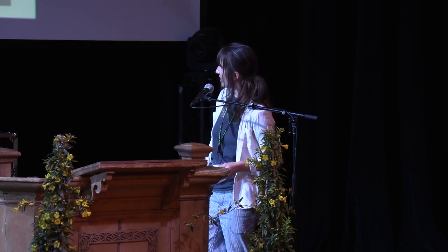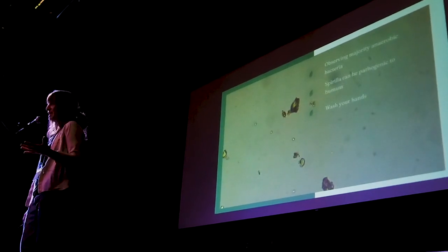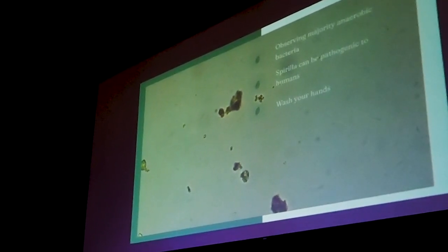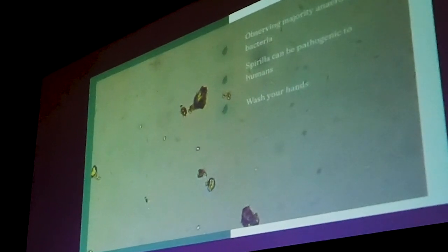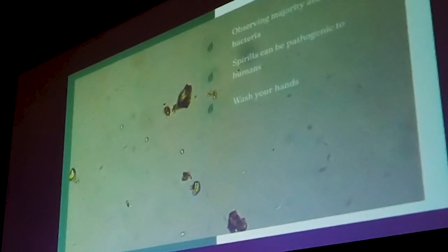It's kind of hard to see on the big screen, but these are the one organism that I really want to warn you about: Spirilla and spirochetes. If you could see them well, they look like a corkscrew spinning through space. Those are all bacteria, super large bacteria. And these guys are pathogenic to people. Not all of them. There are many species of Spirilla and spirochetes, but some of our worst diseases, some of the stuff that can really take human life, are connected to these organisms.